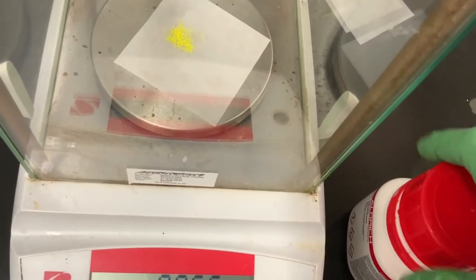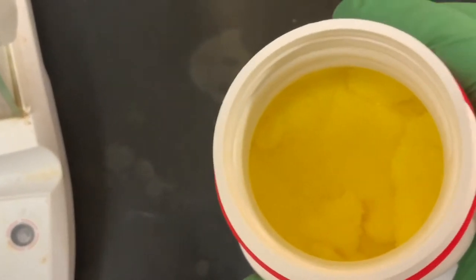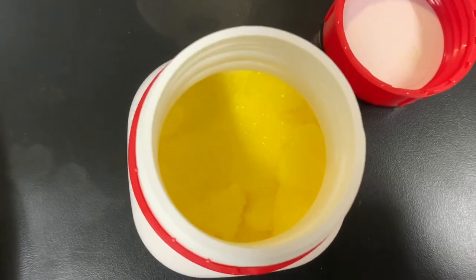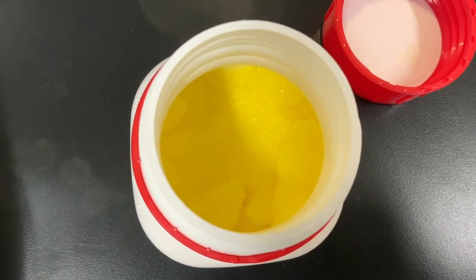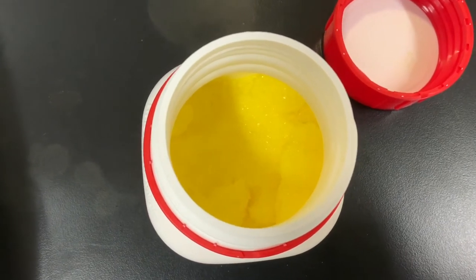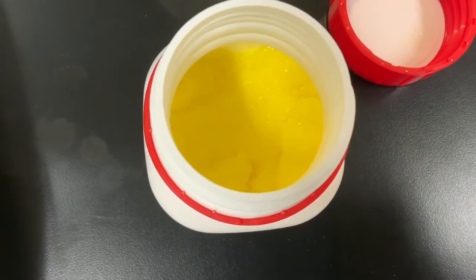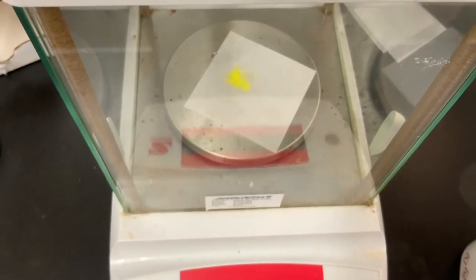And if we open the bottle, we can see that it's very nice, shiny, yellow crystals of 9-fluorenone in there. And it's not surprising that this compound is not white due to the fact that you've got conjugation with the carbonyl. And so as a result, when it absorbs light, it gives off the wavelength of yellow to our eye. And so there we are going to start with 56 milligrams of 9-fluorenone.